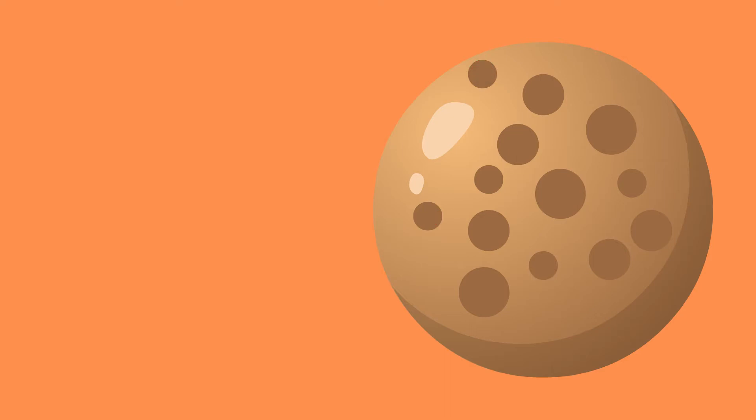Small molecules will go through these pores and their flow through the column will therefore be slowed down. Large molecules cannot enter at all and are therefore able to move at a quicker pace through the column since they don't get distracted by these beads.